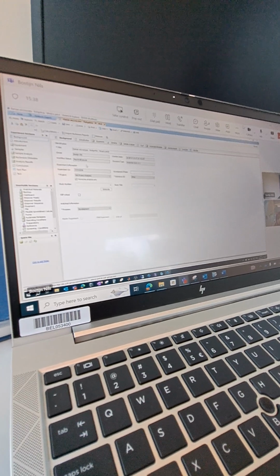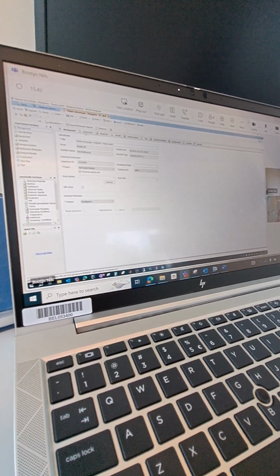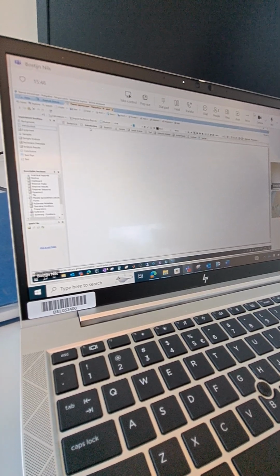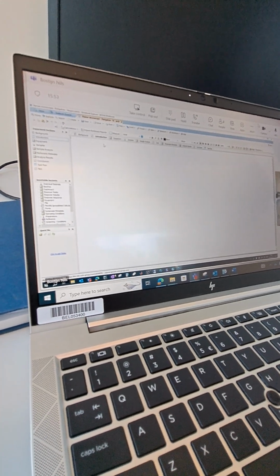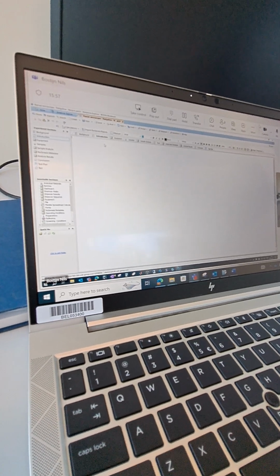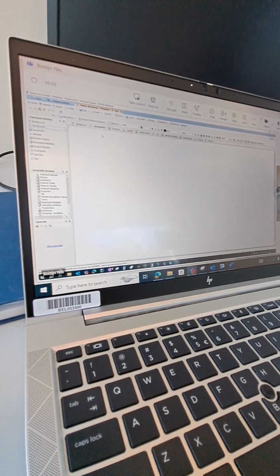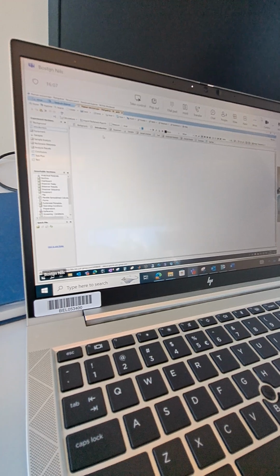It's the background. Then we have a lot of tabs here, but for you, an interesting one is introduction. For everybody, but some of them won't be interesting for you. So okay. Introduction here, you just give a brief explanation. You can say this: the aim of this experiment is to assess the disproportionation of this salt using this equipment and so on. So it's a kind of introduction of what is the aim of the experiment.